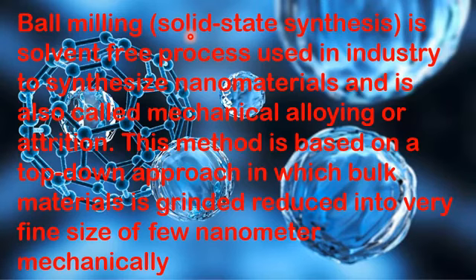So in ball milling, the solid bulk material is crushed to a size of a few nanometers. Please note that the ball milling method is usually a solvent-free method. No chemical solvent like alcohol, toluene, water, etc. is used in the ball milling method.